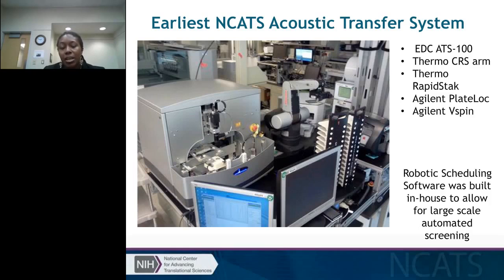And the same software developer that built the automated plate reformatter also built robotic scheduling software in-house so that we could do large-scale screening of multiple plates without having a person there to move plates on and off this platform.